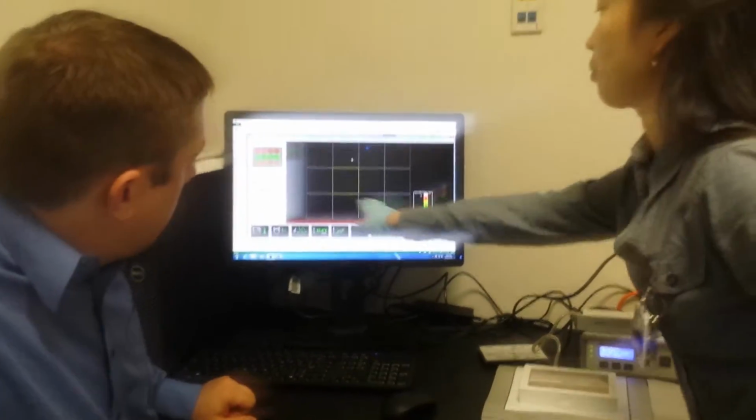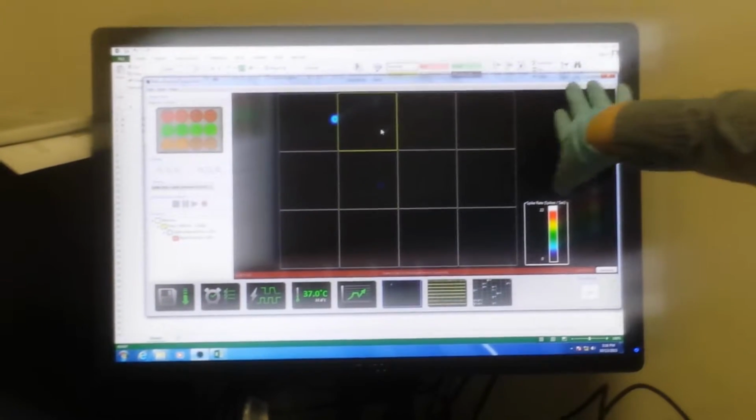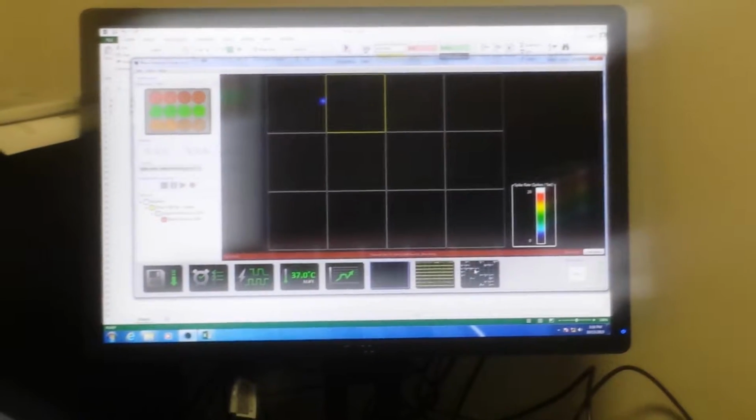Yeah, I was expecting that nothing appears here. Yeah, expecting way more signals to appear in the top row.